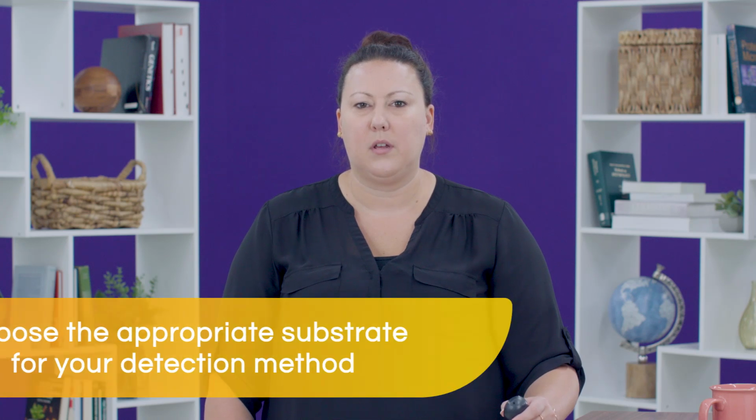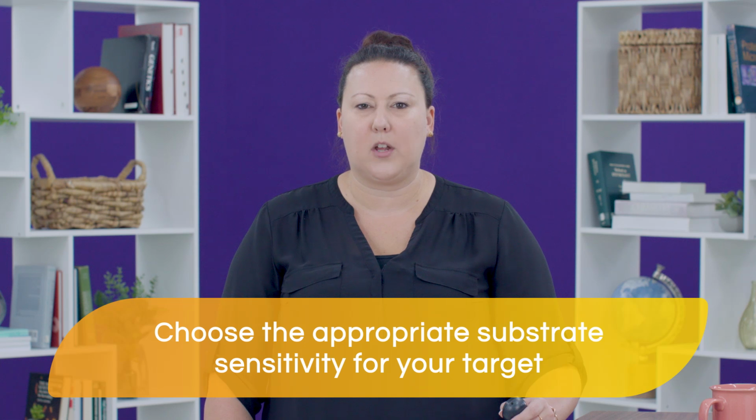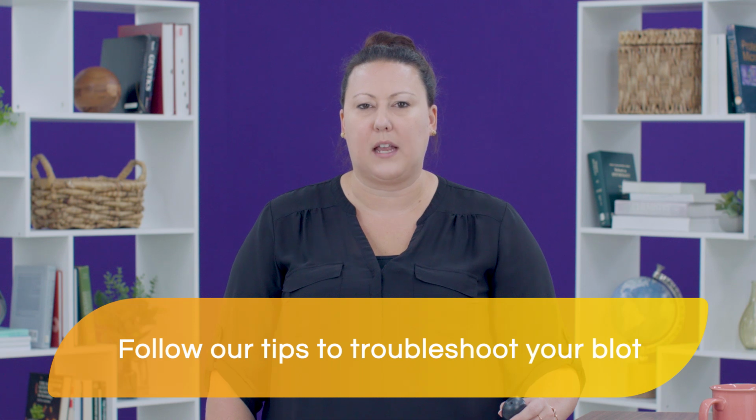In this lesson, we have talked about the important steps involved in the detection of your chemiluminescent Western blots. Examples include making sure to choose the appropriate substrate based on whether you will use X-ray film or a digital imager in order to measure the signal, choosing the appropriate substrate sensitivity based on the abundance of your protein target, and troubleshooting your blot if you have issues with things like high background, nonspecific bands, and other issues we discussed.